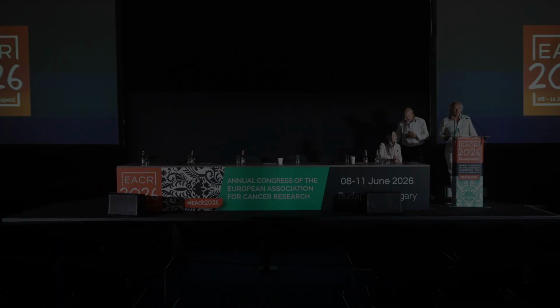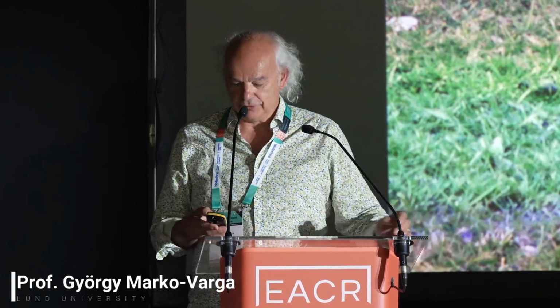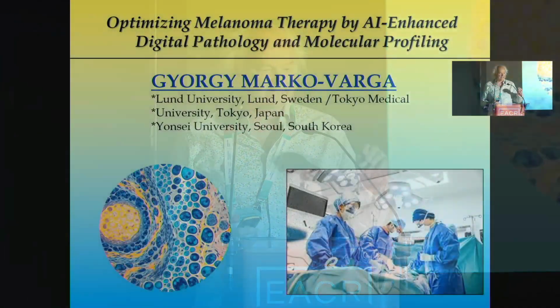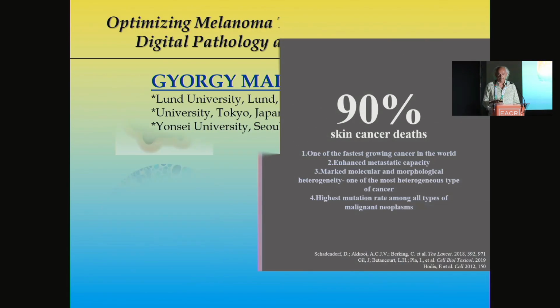So with that said, we'll stop this and we go over to Professor György Markó-Varga from Lund, to describe a proteomics workflow from FFPE as well. Okay, good afternoon, everyone. Very nice to be here. I'm György Markó-Varga, and I'm going to tell you a little bit about the development that we have with formalin-fixed material. So this is a great asset since pathology departments have very, very big collections over decades with these samples.